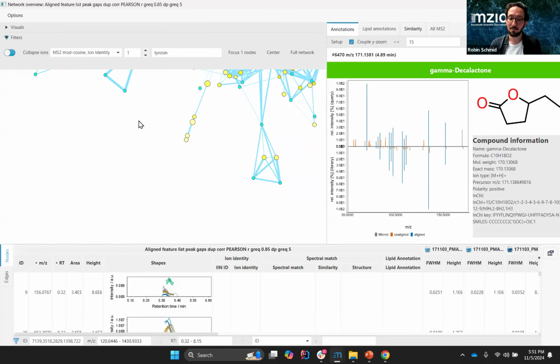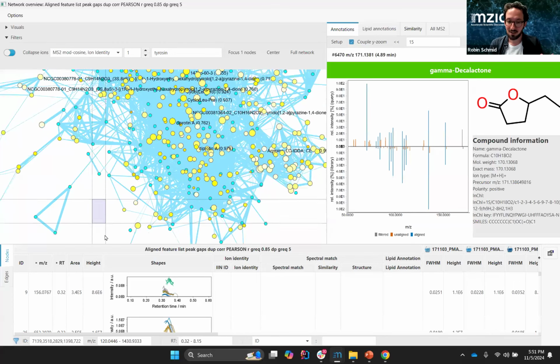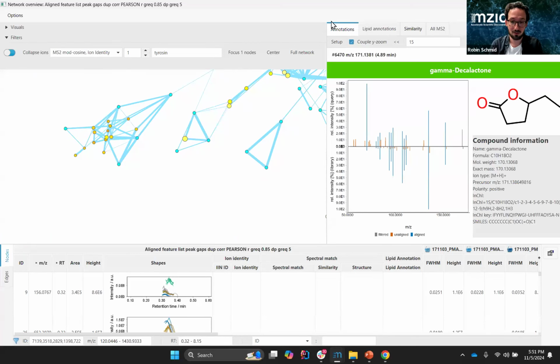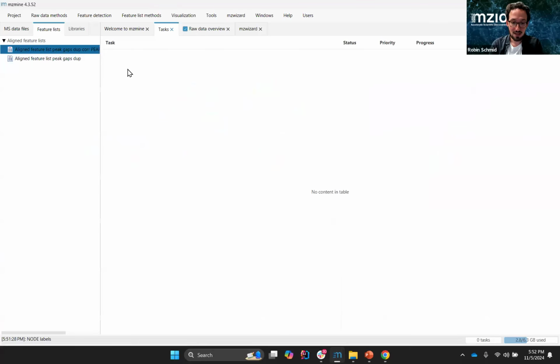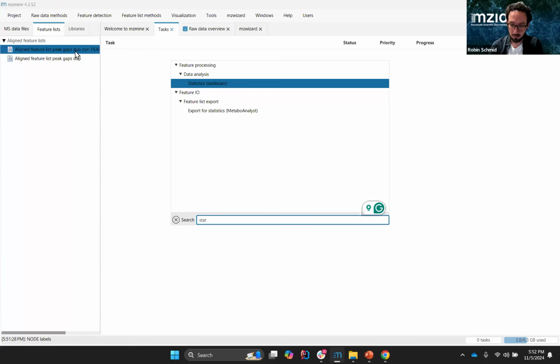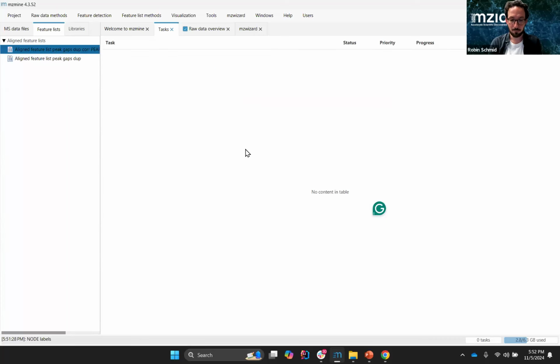And this is why we very much like to show you a neighborhood. So you get one annotation, you know it's important, it's significant for your analysis, and then from there, you can go on to the next neighbors, and you can propagate these annotations to other networking nodes. And so we ran the networking. So let's open the statistics dashboard again, maybe.